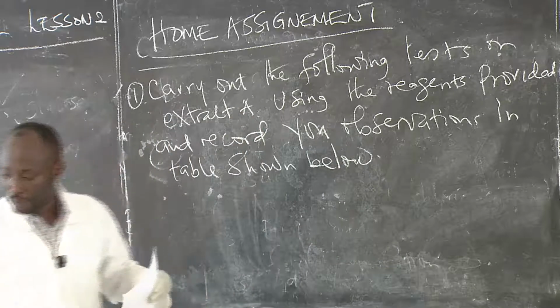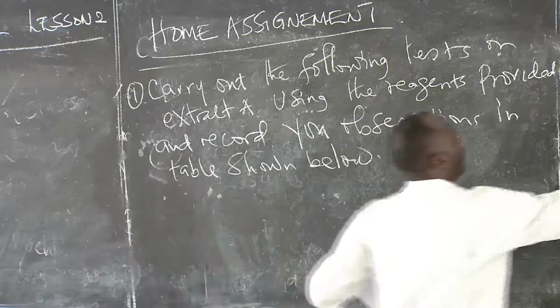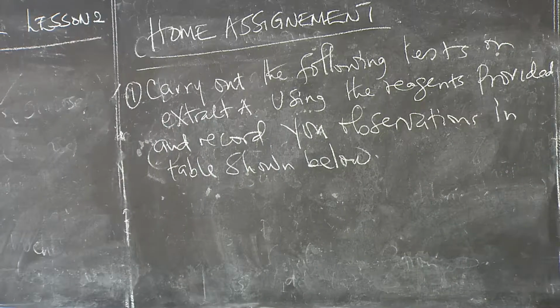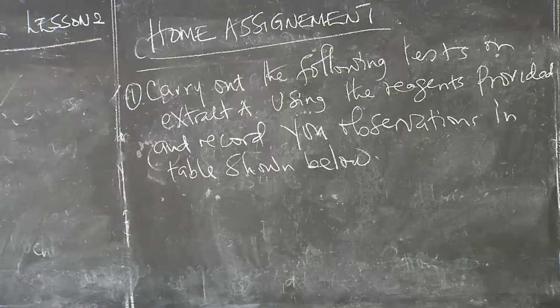So let us have the table. Let's have the table, and we discuss briefly what we're going to be doing in that table.